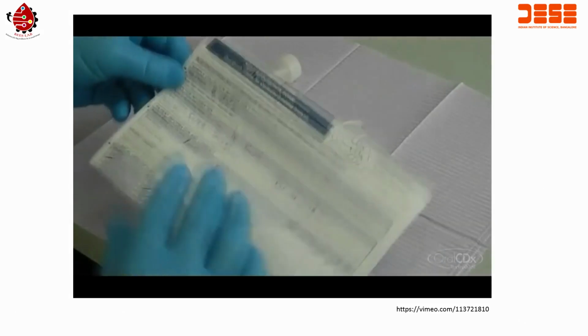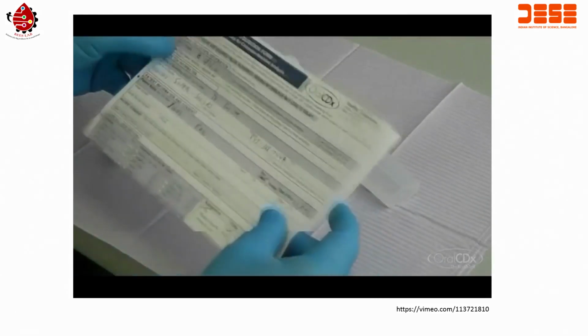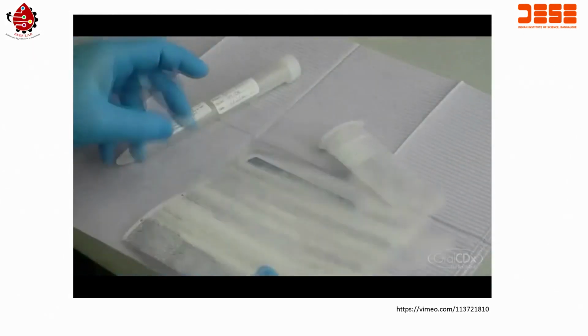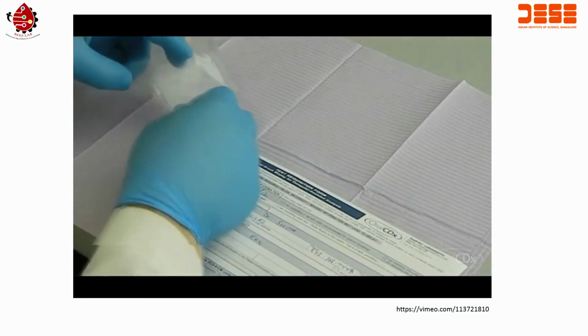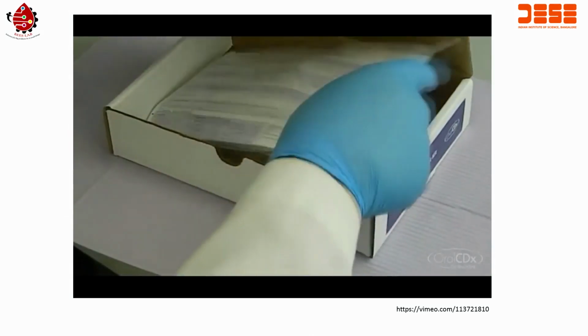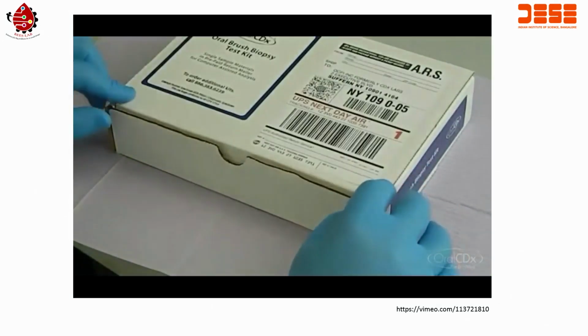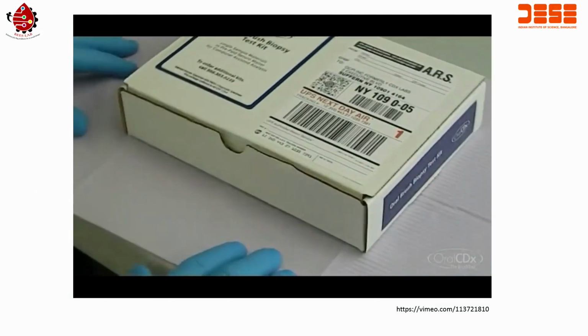Packaging. While filling out the test form, be sure to complete the shaded areas. Missing information may delay the processing of the specimen. Insert the slide holder with the slide and the vial into the kit bag. Finally, seal the prepaid mailer for shipment to CDX Diagnostics via UPS.